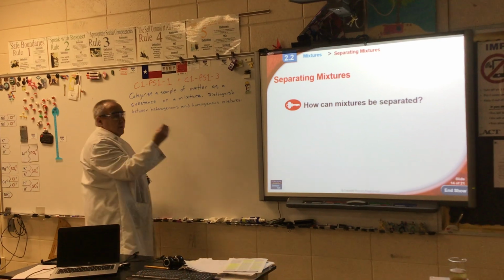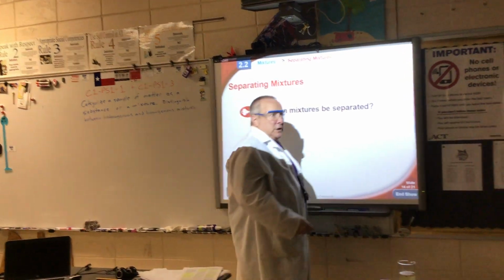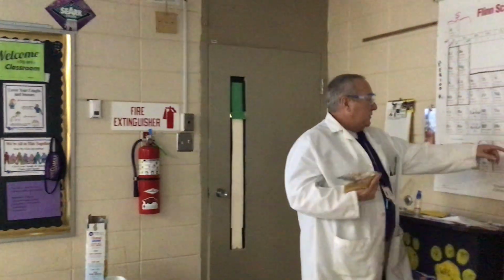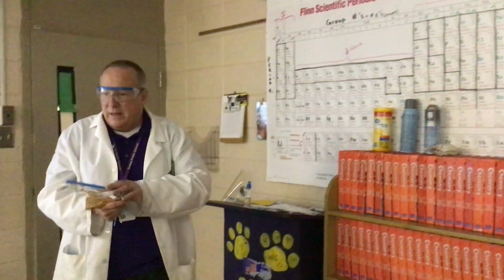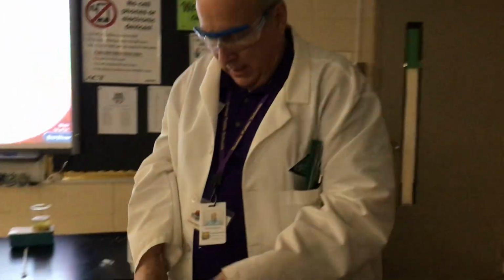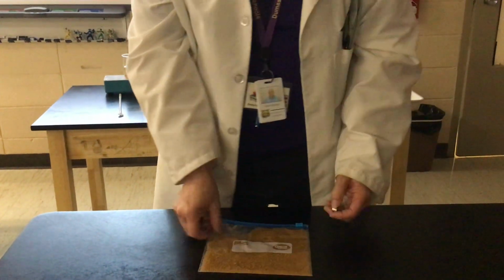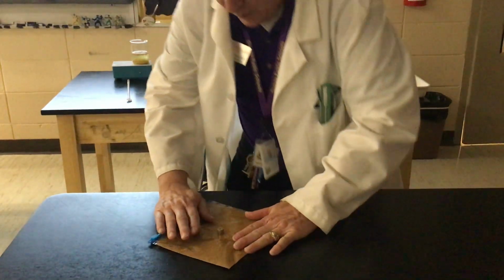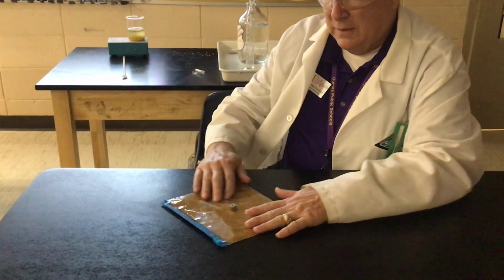around a very strong neodymium magnet. Neodymium magnets are made with a magnetic metal called neodymium. It's element number 60 down here in the lanthanide series. And they are very, very powerful magnets. So I'm going to put the magnet here. Actually, let me do it on the clear side. I'm going to put the magnet here and push my slurry back and forth, trying to leave the magnet in the same place and see what we can find.